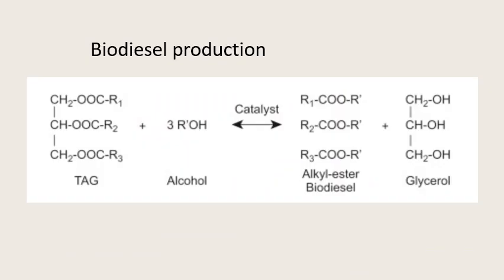We can see that for biodiesel production, these steps are really similar to Alice Ball's method. So we are turning this vegetable oil into methyl esters. In fact, in nature, fats are generally triesters, which are derived from glycerol and these fatty acids. And this biodiesel is also called fatty acid methyl ester, shortened as FAME.